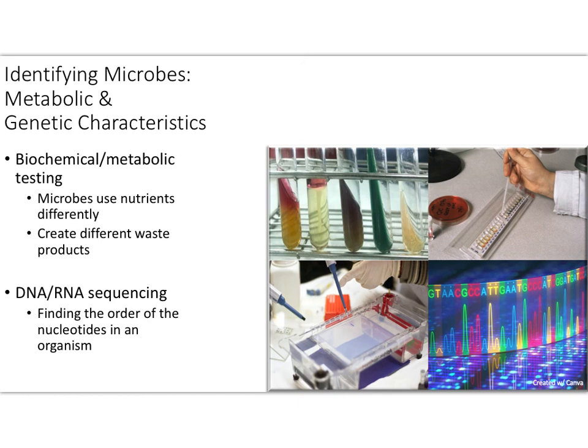But this method is, while it's very precise, very exact, it does take a little bit more time oftentimes than something like biochemical testing. It can take a little bit more skill and a lot more training to be able to do correctly and make sure there are not any errors in it. So it's not used as often as something like biochemical testing or maybe things like staining and microscopy. However, it is used and it can be used when we need some type of exact identification of a microbe, either in a medical or research setting.